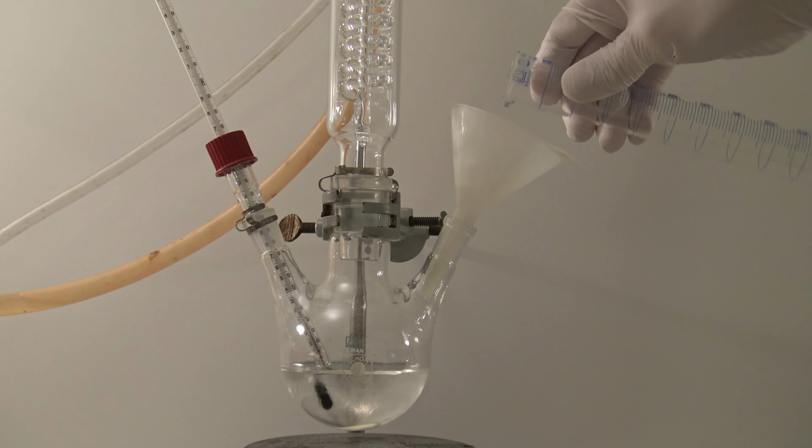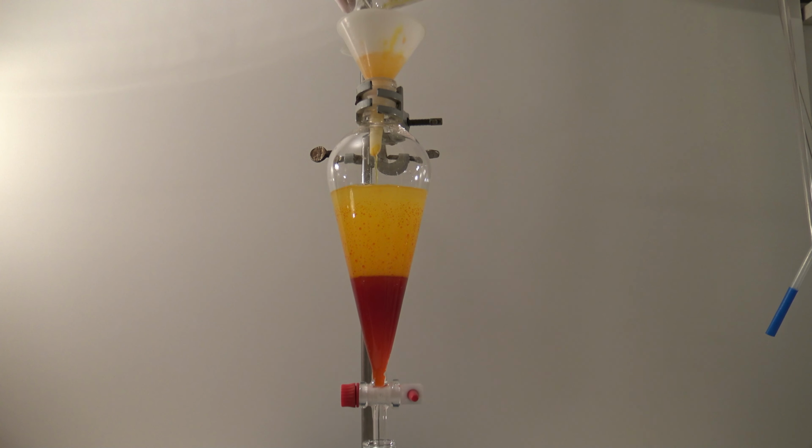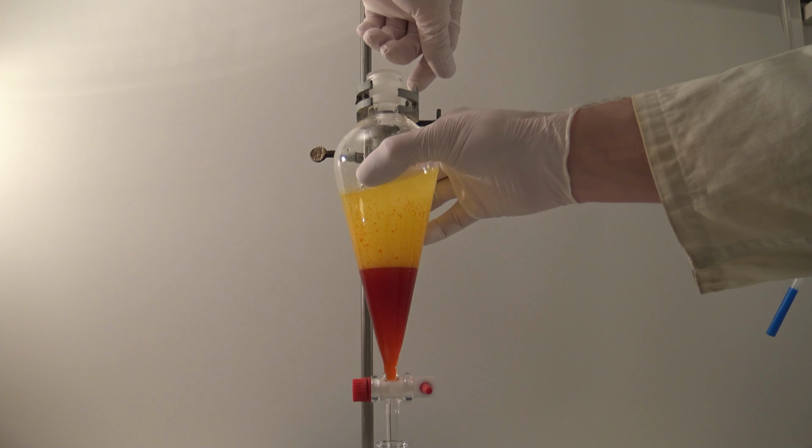Next, the mixture was added to a separatory funnel to separate the layers. The volume could not be predicted, so the water was added in a beaker, but here it can be seen that this step could have been done right in the separatory funnel. The beaker was washed out with distilled water. The funnel was swirled to get the drops that stuck to the wall to go down.